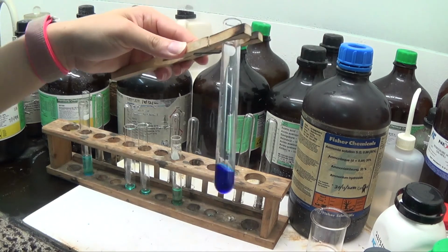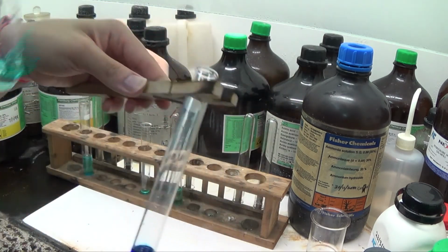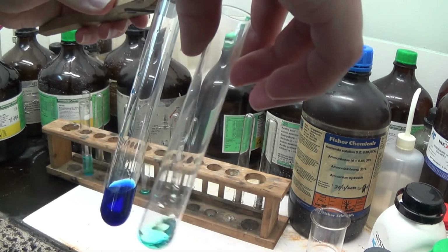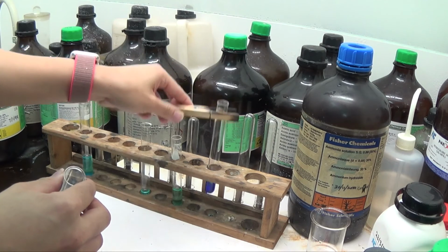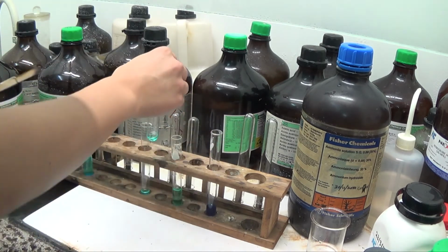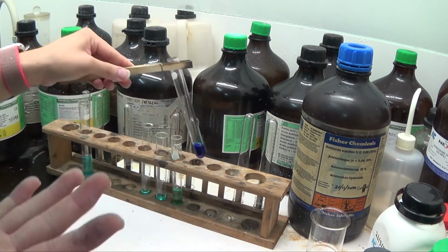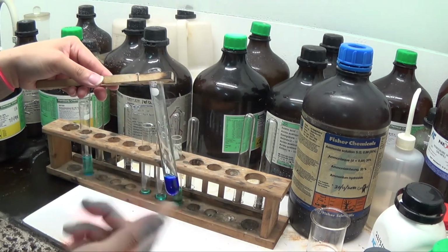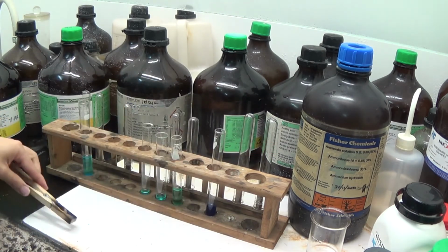So that is the really deep blue solution that you get in the presence of excess ammonia. I already have way too much ammonia actually, so that's why I get the deep blue straight away. By right I should have a pale blue precipitate first. Okay, I think my ammonia is too concentrated.